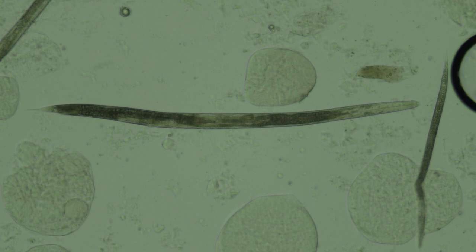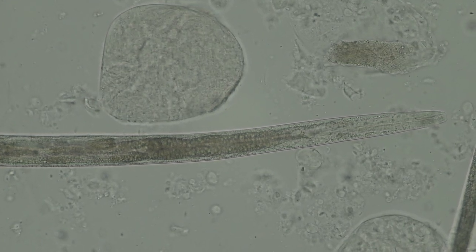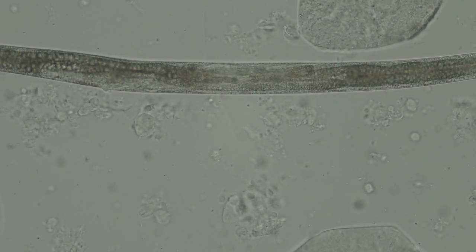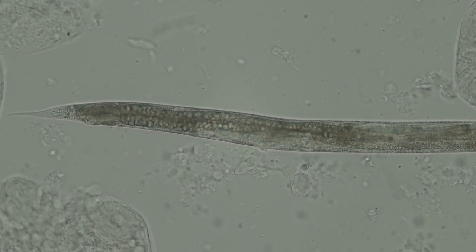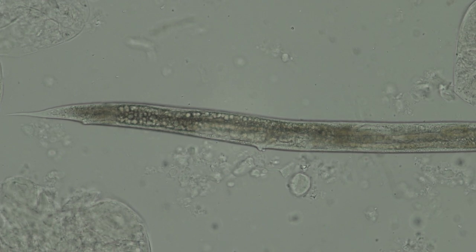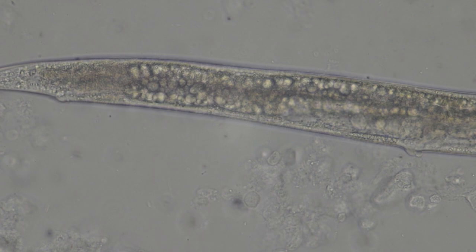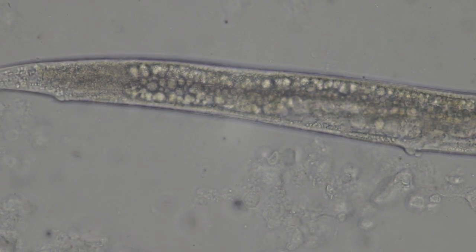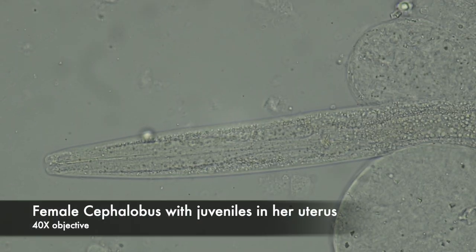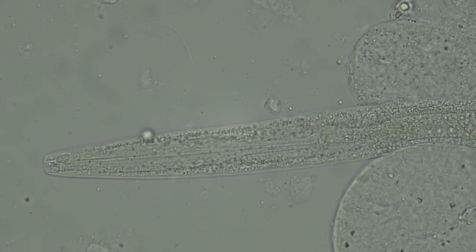This female's anterior end is on the right, posterior to the left. In this female's posterior half you can see two bumps — the posterior one is the anus, and the one closer to the middle of the body is the female gonopore. Cephalobus sperm enter the female gonopore at mating, and embryos develop to the first larval or juvenile stage inside the mother. This female, who has a really nice pharynx, is carrying three or four young worms inside of her.